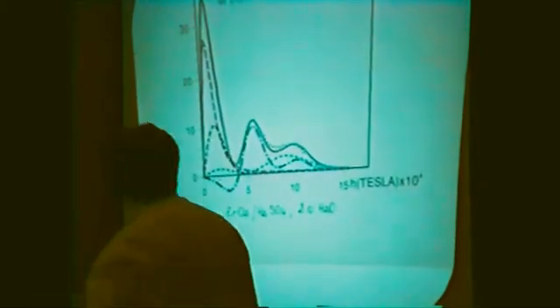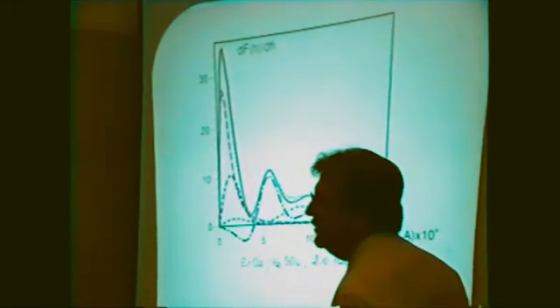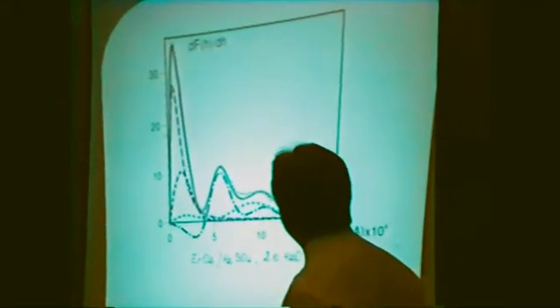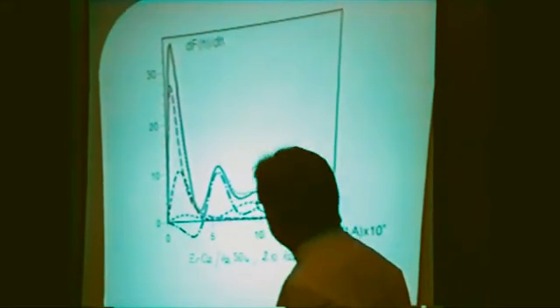That means that you need about 2 water molecules per acidic OH group to engage 1 acidic OH group in the formation of hydroxonium. That means you find exactly the same result we will have in a few minutes. That means you have a very strong acidic group, but the second one is like sulfuric acid. You don't have any interaction between the adsorbed molecule and the second OH group of the sulfur. If you increase the water concentration, you don't change at all the concentration of the hydroxonium ion. That means the second acidity is very, very low.